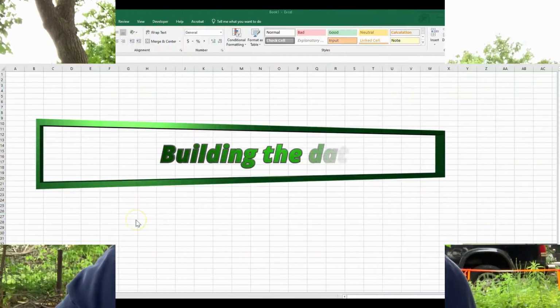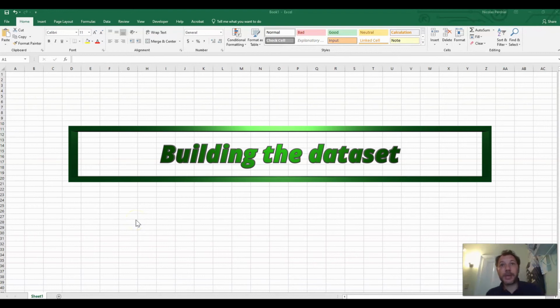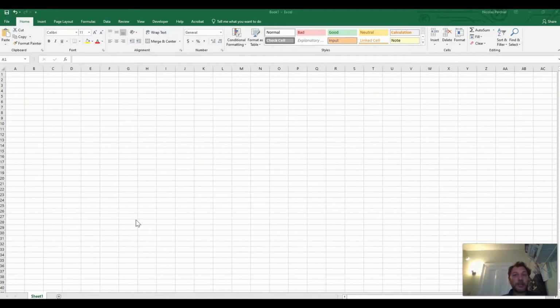This we will do using Excel. To build our dataset, we will use Excel, or you can use any other type of spreadsheet software. Excel is the most common, and it's the one that most of you are going to be using. What we need in order to build our dataset is a certain amount of column information and rows for the number of samples. Hopefully all these columns should be the same across datasets so that if we ever need to, we can combine these datasets.